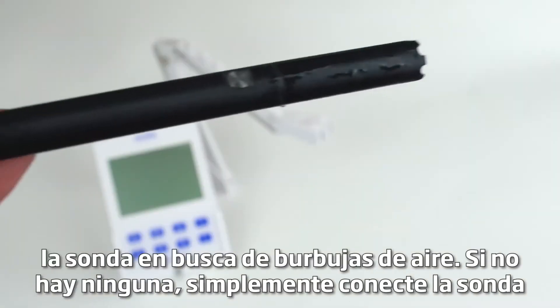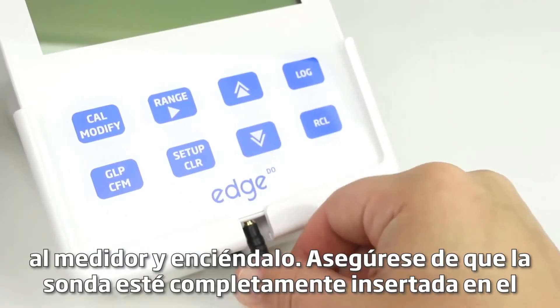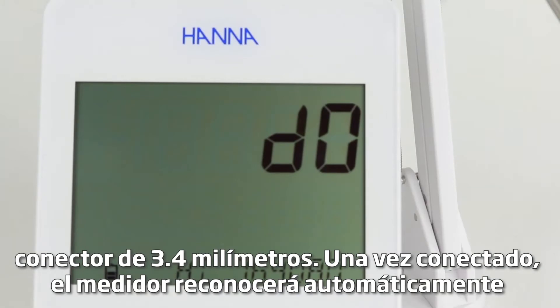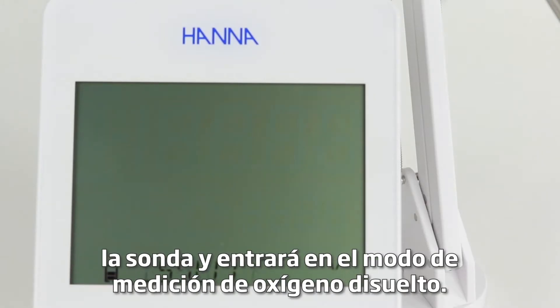Inspect the bottom of the probe for air bubbles. If there aren't any, simply connect the probe to the meter and turn it on. Ensure that the probe is fully inserted into the 3.5mm connector. Once connected, the meter will automatically recognize the probe and enter dissolved oxygen measuring mode.